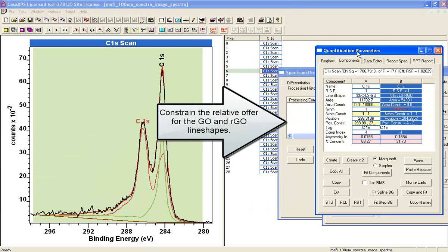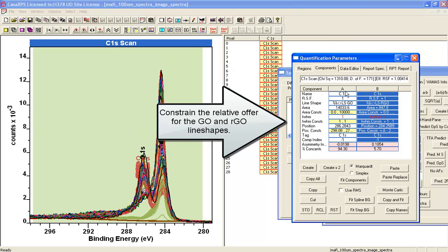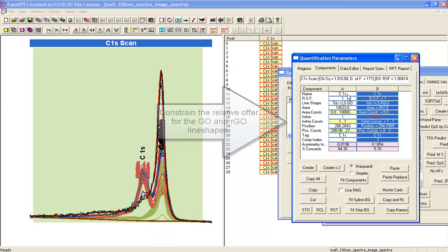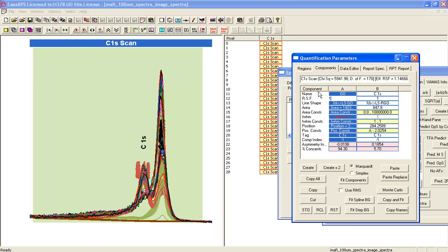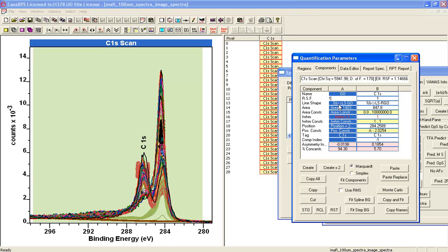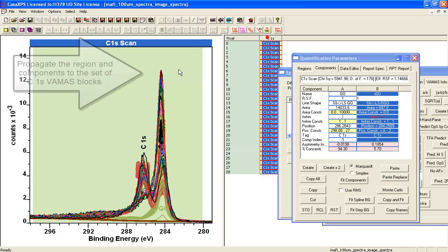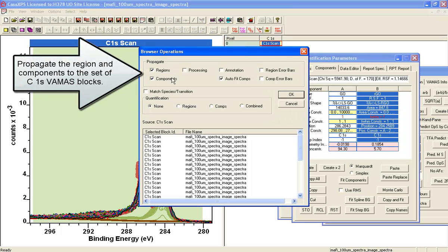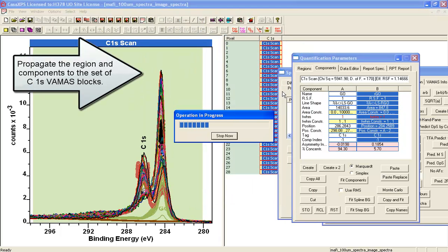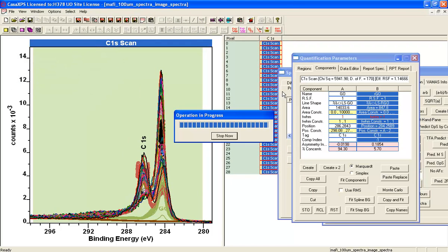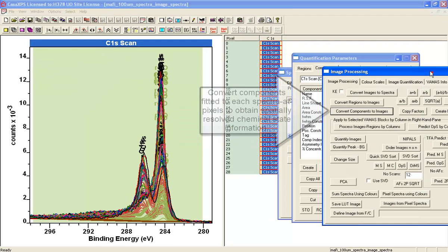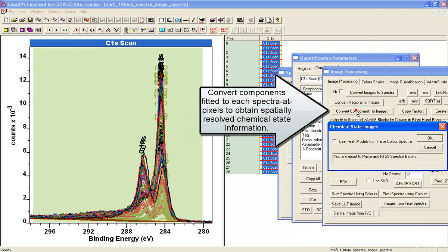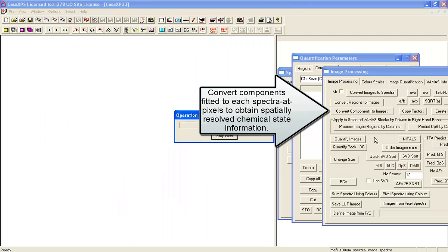What we need to do is say this is the graphene oxide, and this one is the reduced graphene oxide. We'll propagate those. Now, having overlaid them in the active tile, we can convert components to images.